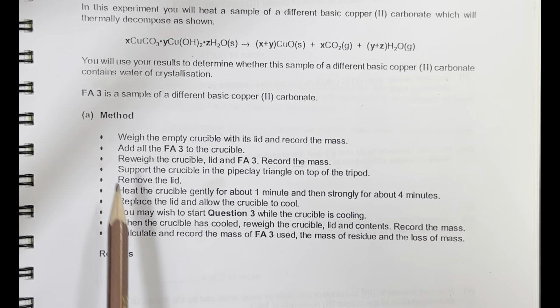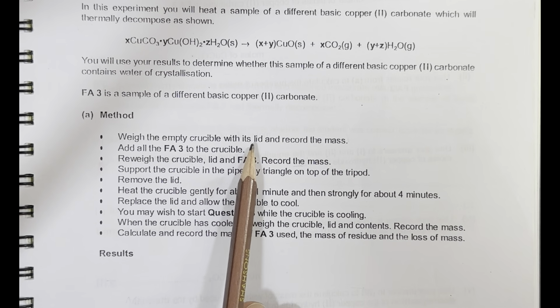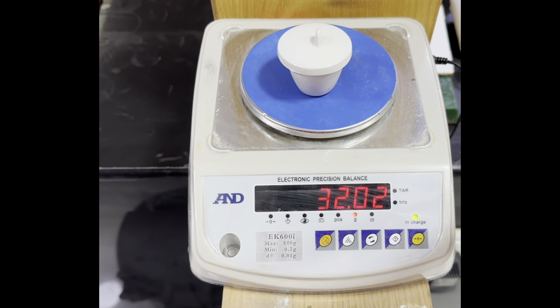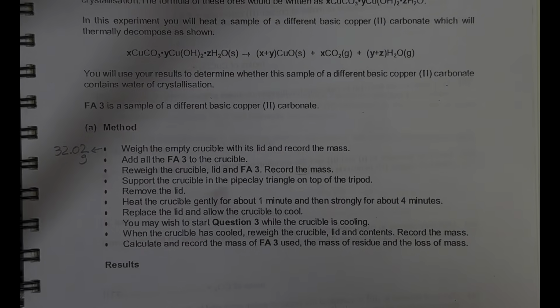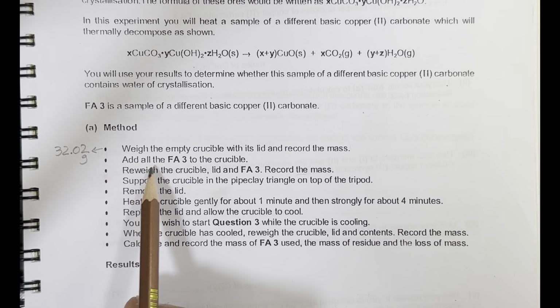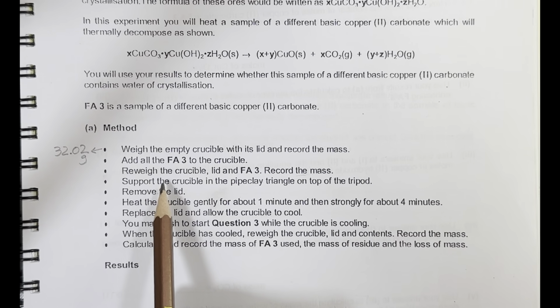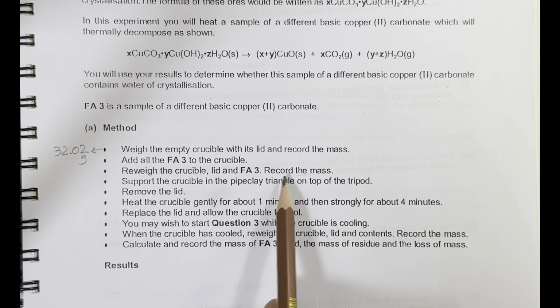Method: weigh the empty crucible with its lid and record the mass. Crucible with the lid, 32.02 grams. Crucible and its lid, 32.02 grams. Add all the FA3 to the crucible. Reweigh the crucible, lid and FA3. Record the mass.